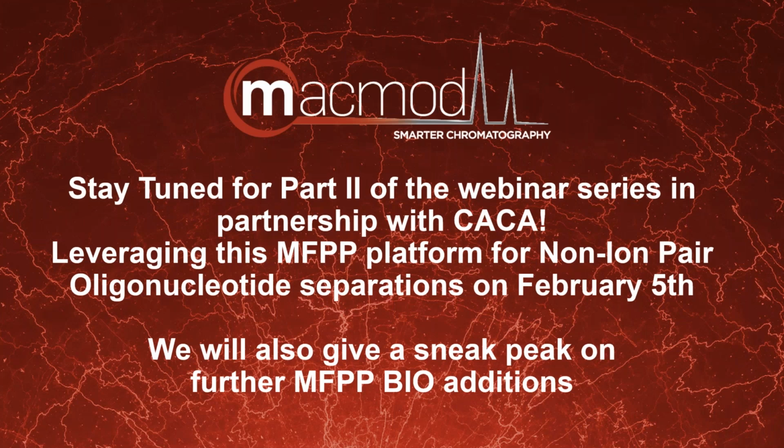So with that, please stay tuned for part 2 of the webinar series in our partnership with CACA. We're going to be leveraging this monodisperse fully porous particle platform for a deep dive into oligonucleotide separations. And we're also going to be talking about how we're leveraging the platform for new innovation in different modes of chromatography like size exclusion, ion exchange, and HIC. So with that, I'd like to turn it back over to E and take any questions.